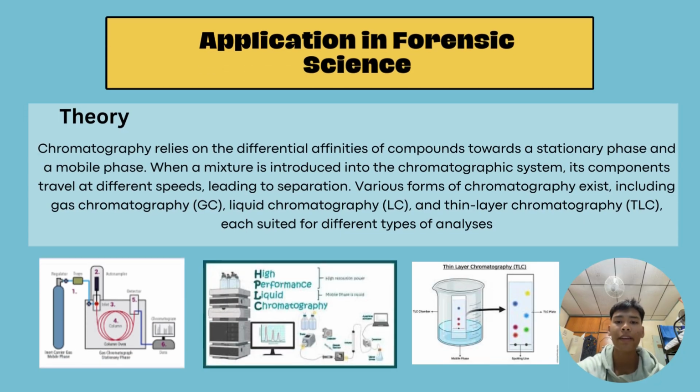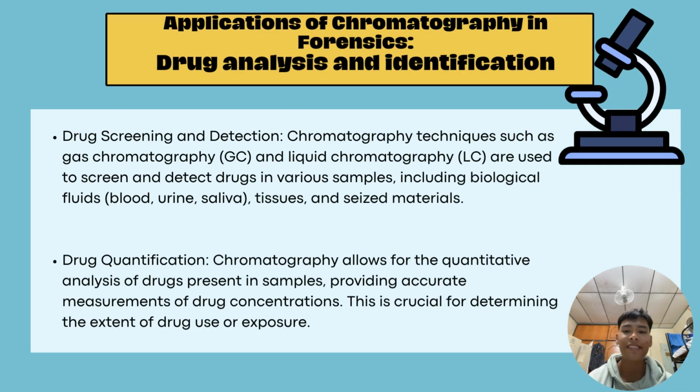Now, let's look at applications in forensic science. Theory. Chromatography relies on the differential affinities of compounds towards a stationary phase and a mobile phase. When a mixture is introduced into the chromatographic system, its components travel at different speeds, leading to separation. Various forms of chromatography exist, including gas chromatography (GC), liquid chromatography (LC), and thin layer chromatography (TLC), each suited for different types of analysis. Now, let's move on to another application of chromatography in forensics.